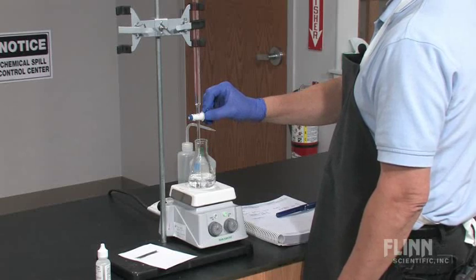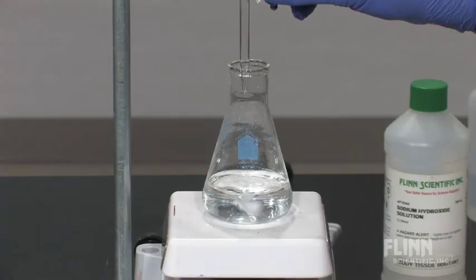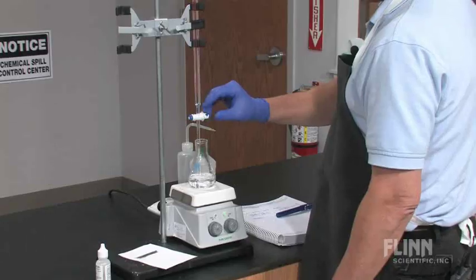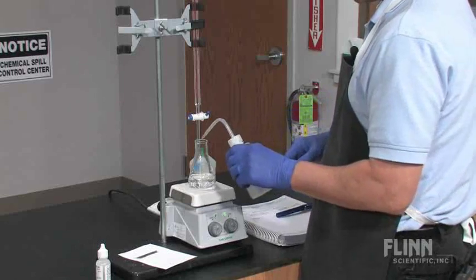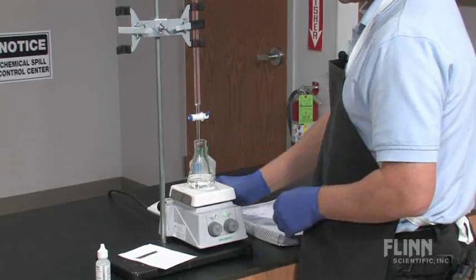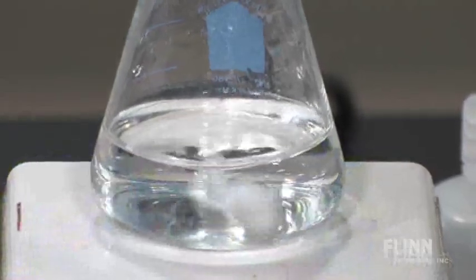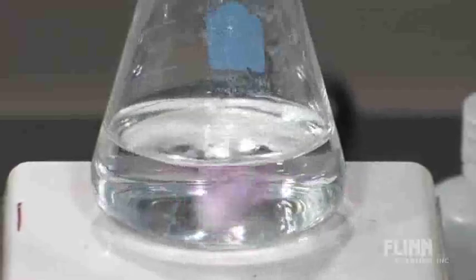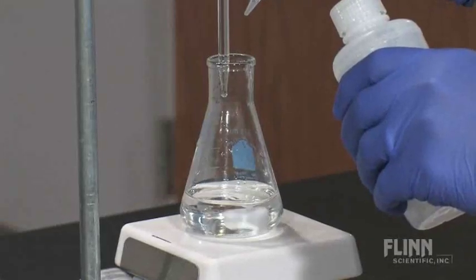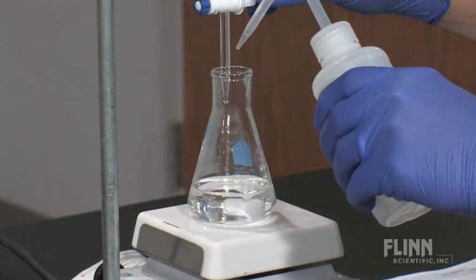Approach the endpoint more slowly and watch the color of your flask carefully. Use a wash bottle to rinse the sides of the flask and the tip of the burette to make sure all titrant is mixed in the flask. As you approach the endpoint, you may need to add a partial drop of titrant. You can do this by partially opening the stopcock and rinsing the partial drop into the flask with a wash bottle.